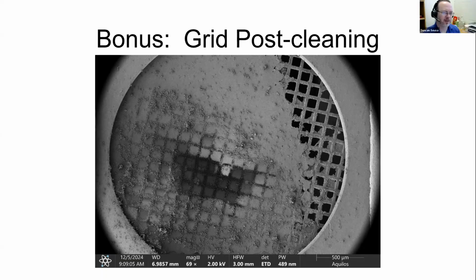Yeah, so I'm clear on the second question, which is how do we manage ice contamination, which is a huge problem. So I'll answer that one first. Basically, you use fresh nitrogen. You should have your 4-liter dewars, and every chunk of thing that you're messing with, anything that's going to be anywhere near that lamella, it's got to be fresh nitrogen out of the tank in a dry dewar.